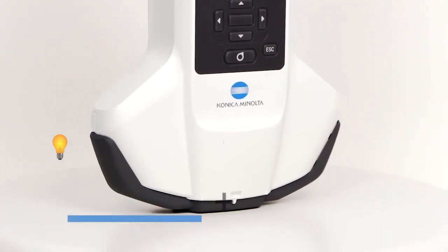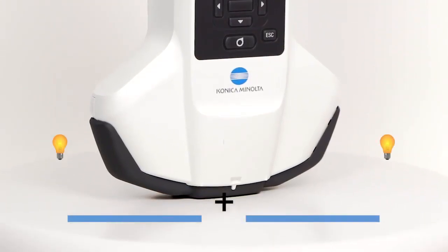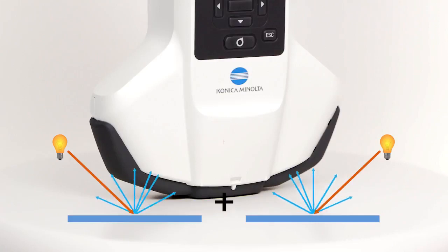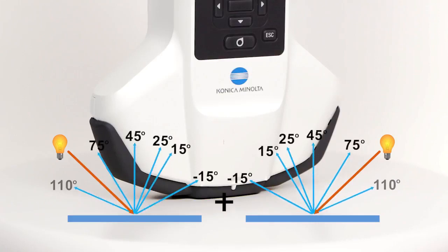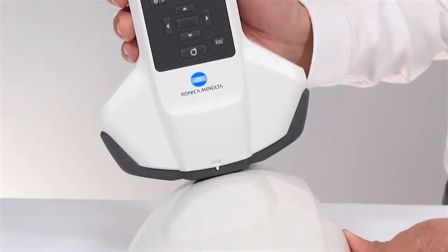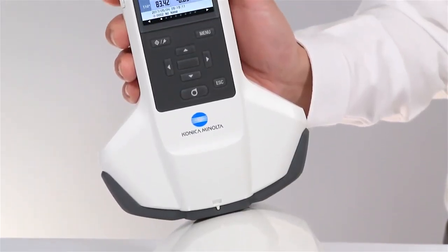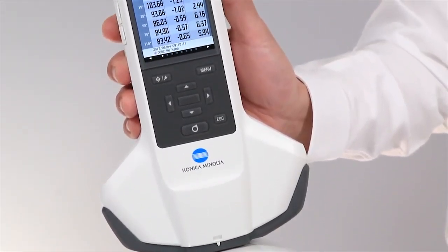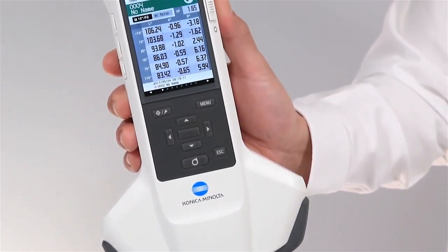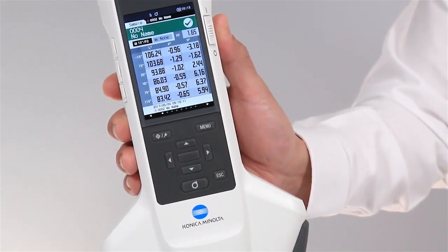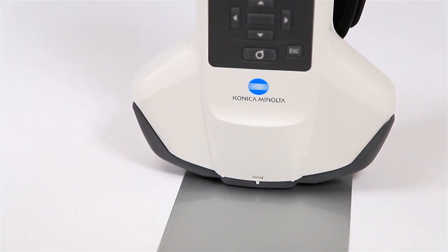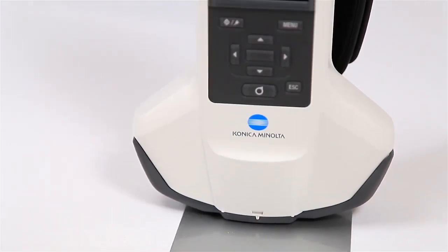A unique double-path illumination system offers error-free orientation that is not found in other multi-angle devices. As a result of this technology, you can quickly produce stable readings on curved or flat surfaces.